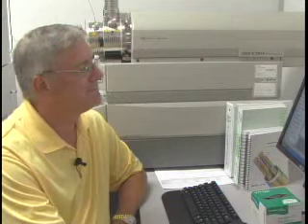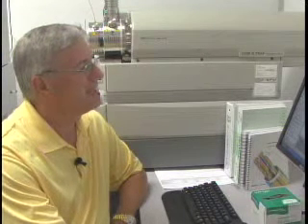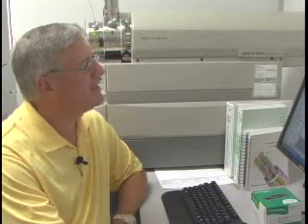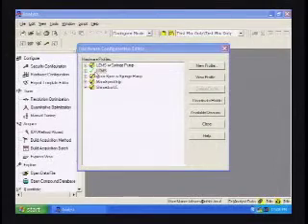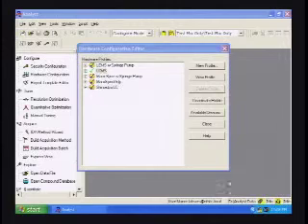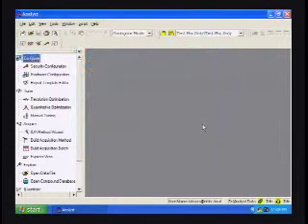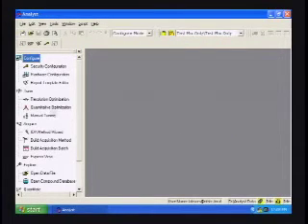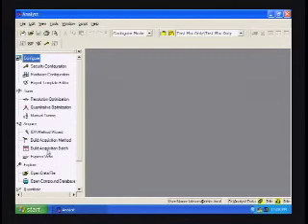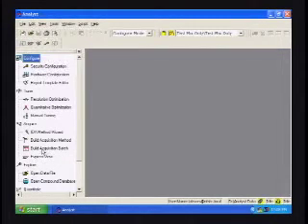Sometimes it takes a second or two. The gas shut off, so we know it's okay. Now we can see that the LC-MS profile is selected. Let's close the hardware configuration and go back where we were to build acquisition batch.